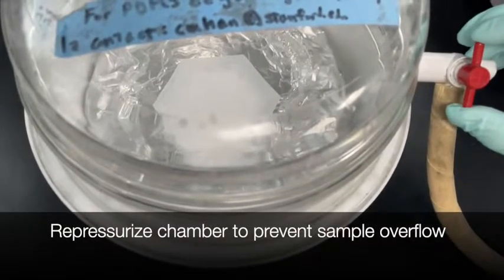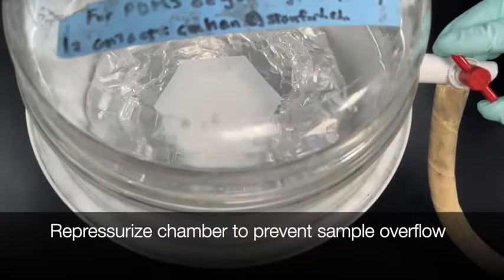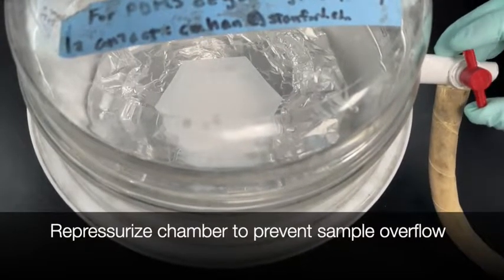To prevent sample overflow, you may need to re-pressurize the chamber throughout the process. Do this by slowly opening the red valve and then closing once the bubbles recede. Following approximately 30 minutes, or when you don't see any more bubbles in the PDMS liquid, you may remove the sample.